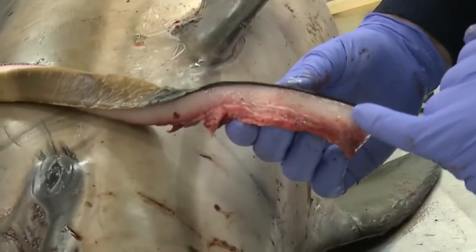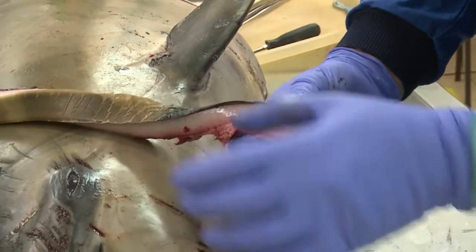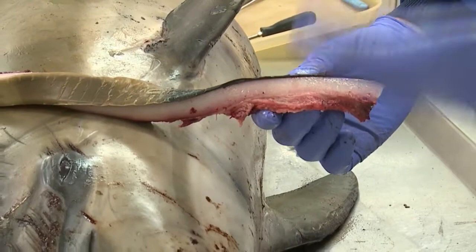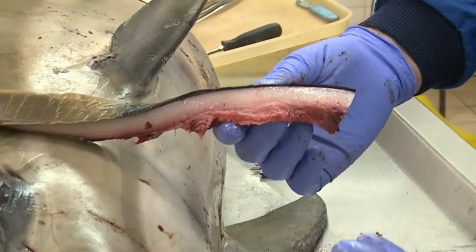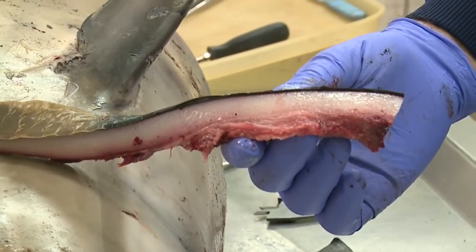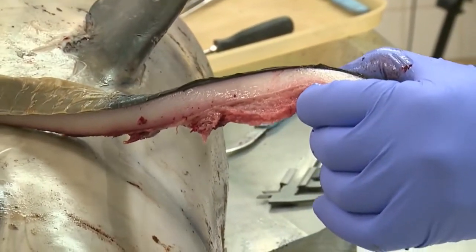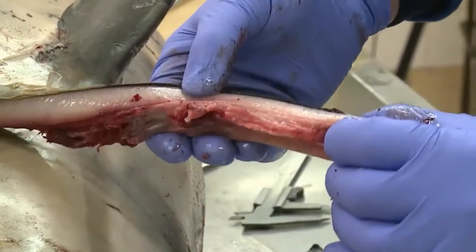They've got a very thick skin, that's the black stuff, and this white stuff, that's the blubber layer. And the blubber serves two broad purposes. It's insulation from the colder water, because it is quite cold now, very seasonally. In the summer it'll be thinner, winter it'll be thicker. And it's also an energy store, so when the animal goes under nutritional stress, say it's not feeding, it begins to mobilise that blubber layer.